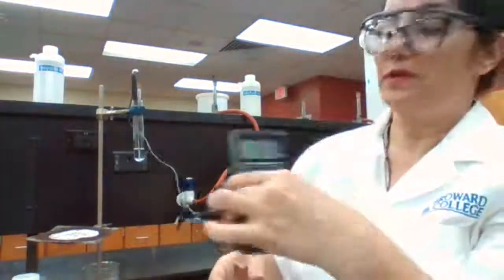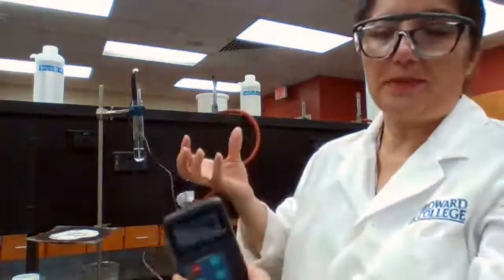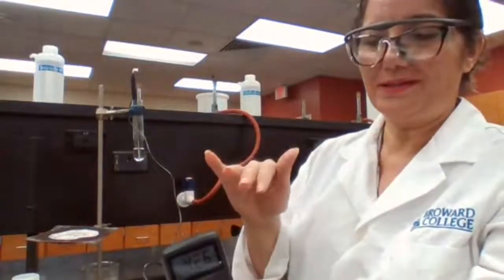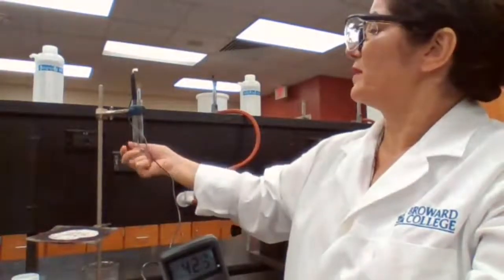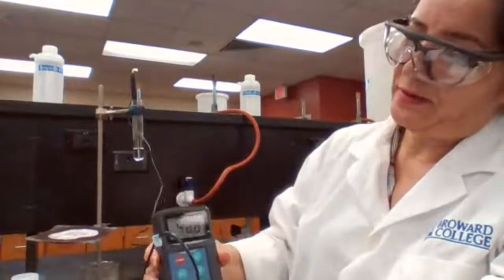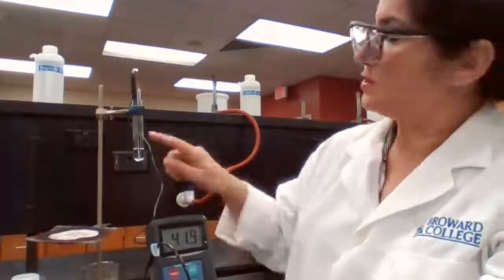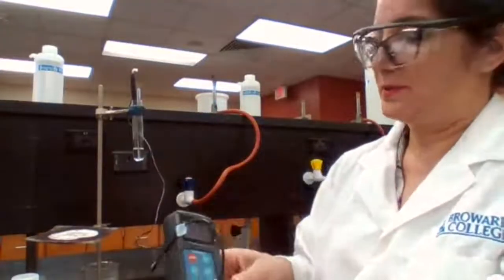The temperature reached 43 and it is still liquid. That's what I mean by freezing point depression. So the solvent, which was benzophenone, froze at 52 using this thermometer, which probably had some error. The solution freezes at a much lower temperature.